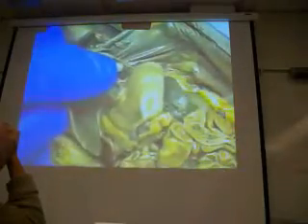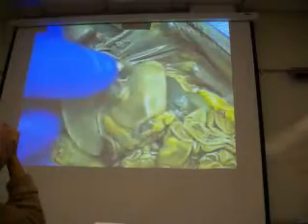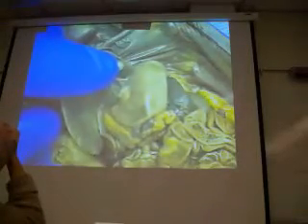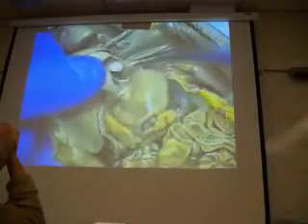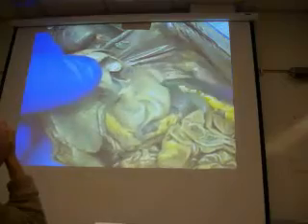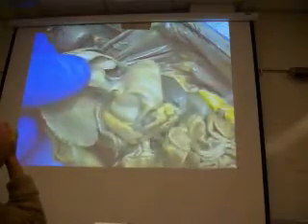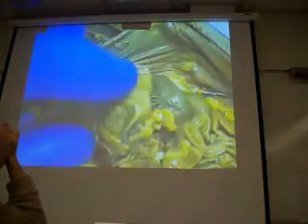I didn't show you the esophagus on the shark and the perch and the salamander just because there's all that stuff right there. I didn't want to rip stuff out of the way. Okay. But it's going to bring it down here to the stomach. So here's the stomach, right over here. Okay. Now, on the greater curvature of the stomach, this outer curve of the stomach, lies the spleen. Okay, so here's the spleen right here.